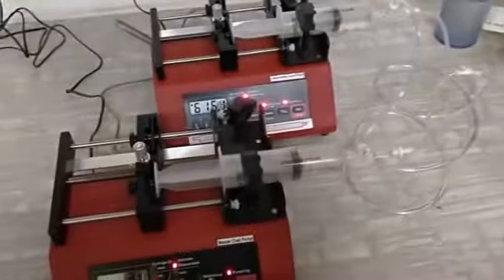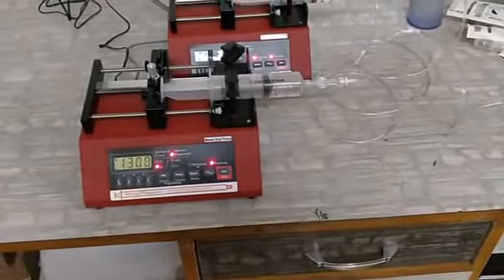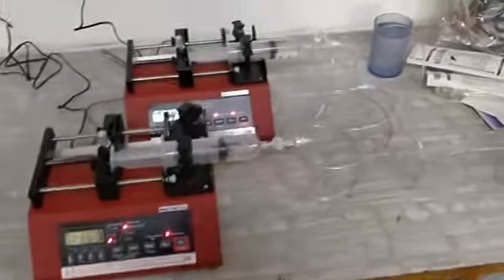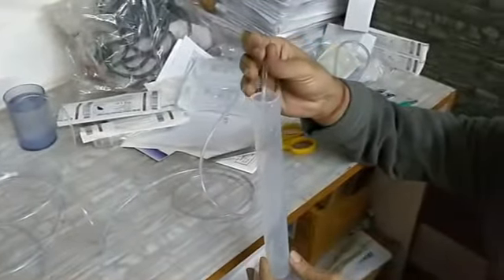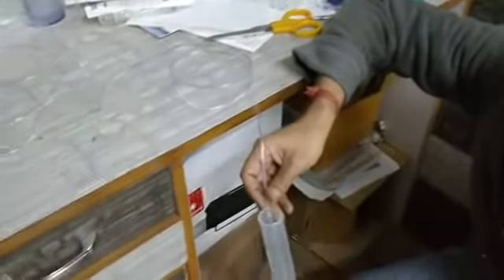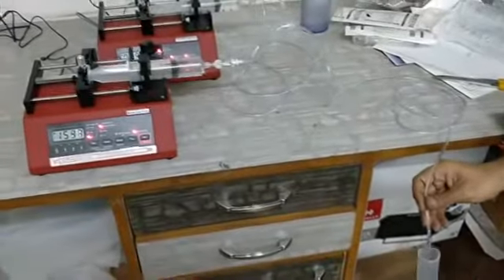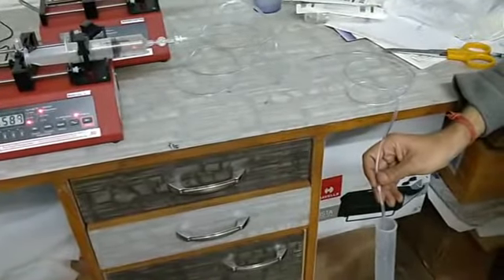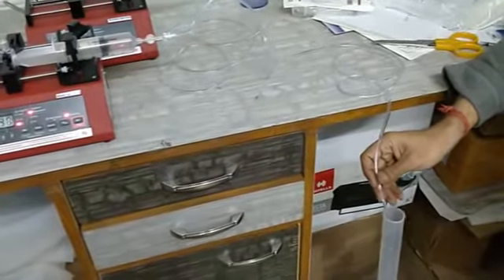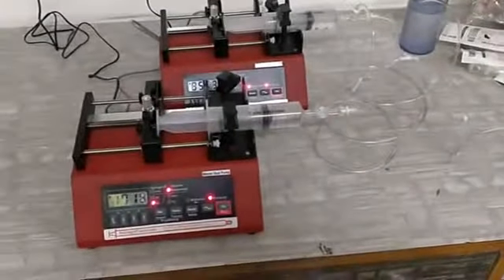One important thing: since this is a microfluidic pump operating at very low flow rates, if you position the output tubing too high, you may not get flow. Always keep your reservoir or output below the height of the tubing and pump. I hope this video has helped you. If you have any queries, please let us know. Thank you very much.